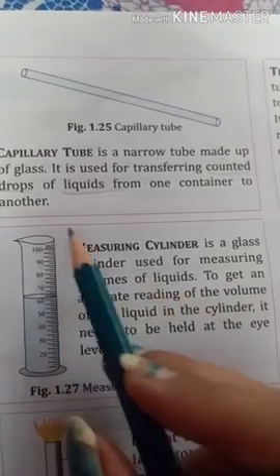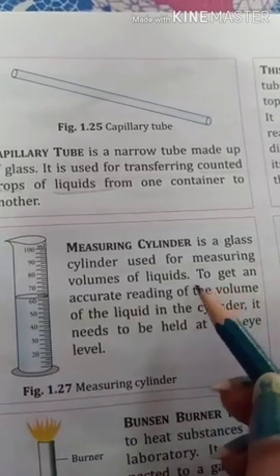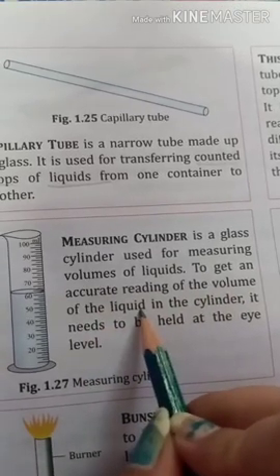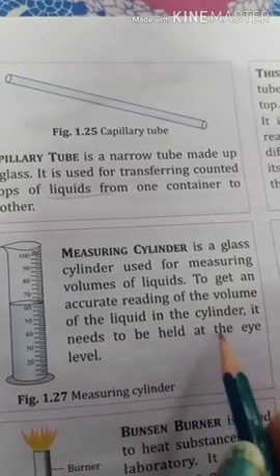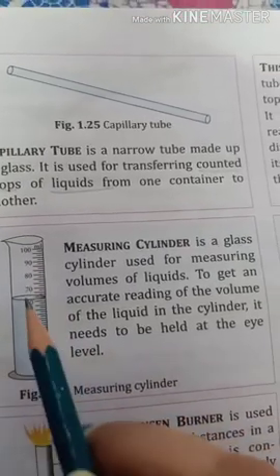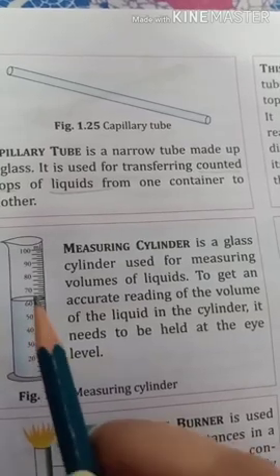While using this measuring cylinder, we will take one precaution: to get an accurate reading of the volume, it needs to be held at eye level. So while measuring liquid in the cylinder, we should keep this cylinder near our eye level.